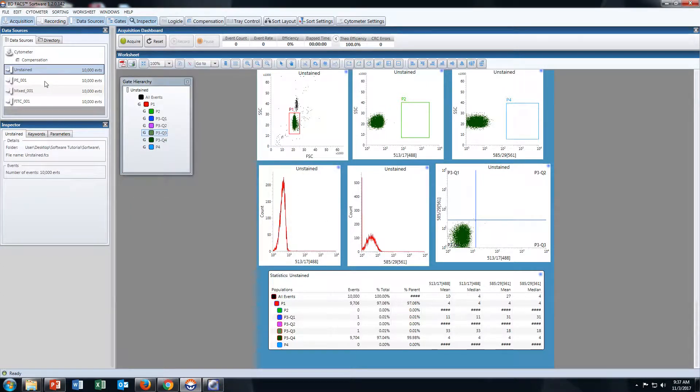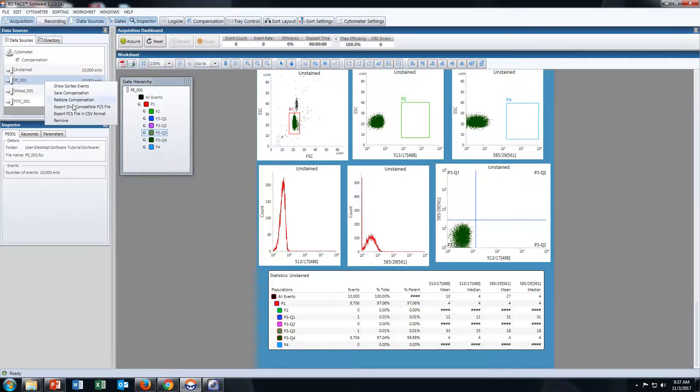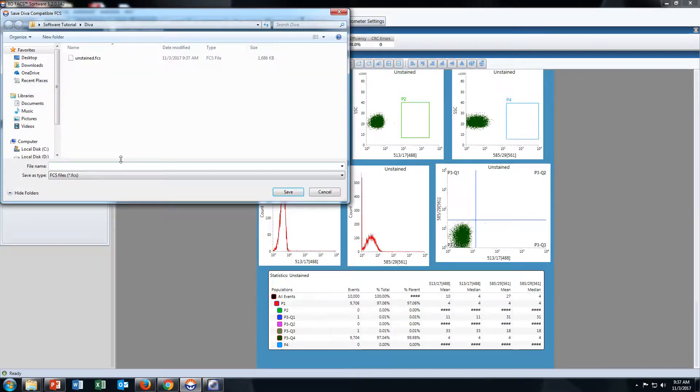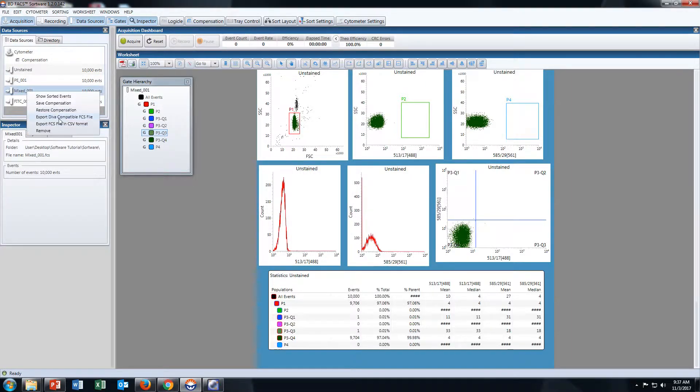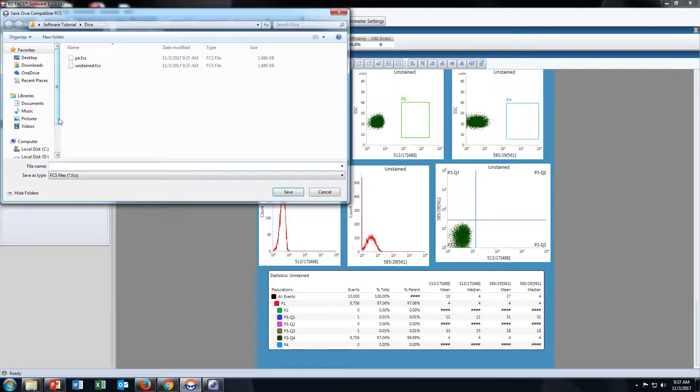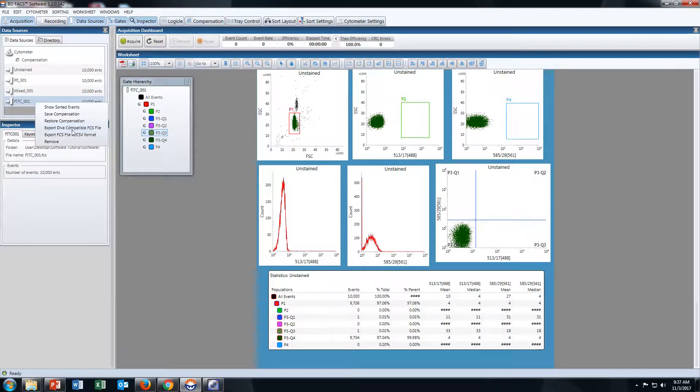Then save all others in the same manner: PE, Mixed Population, and FITC.